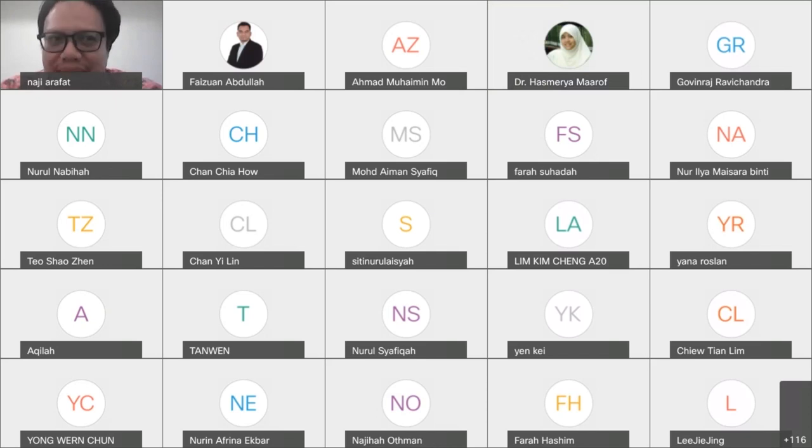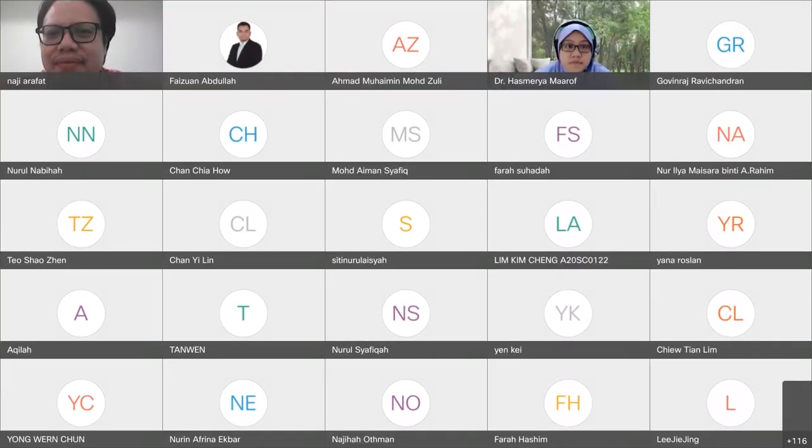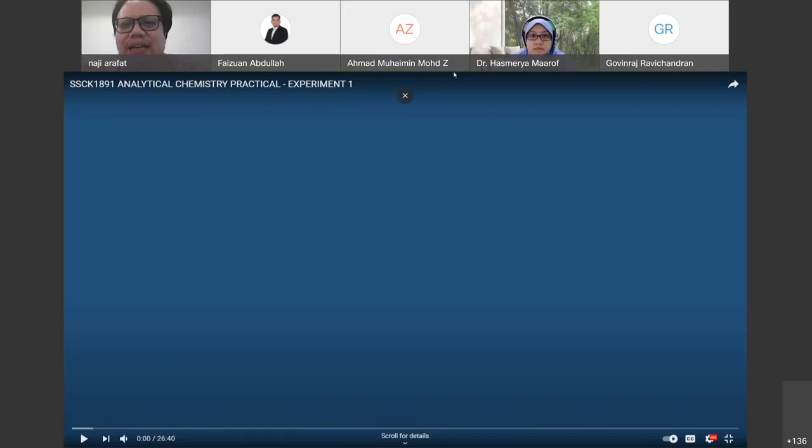Now, do you get my point? Do you get my point? Right. Okay, sekarang ni berbaloi tak kenapa kita nak buat eksperimen ni sekarang ni? Setelah kita dah tahu apa itu gravimetric dan kenapa kita kena buat analisis nickel. Nickel ni tak nampak dengan mata asal kita dalam air tu. That's why kita kena convert into something yang kita boleh nampak. Okay, clear? Are you guys clear about that? Okay, yes, very good. Now then we can proceed with the experiment after knowing it.